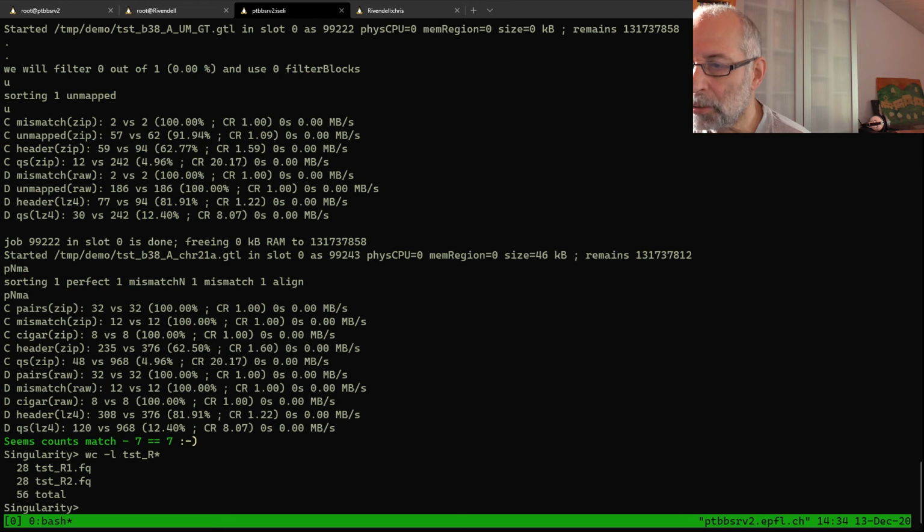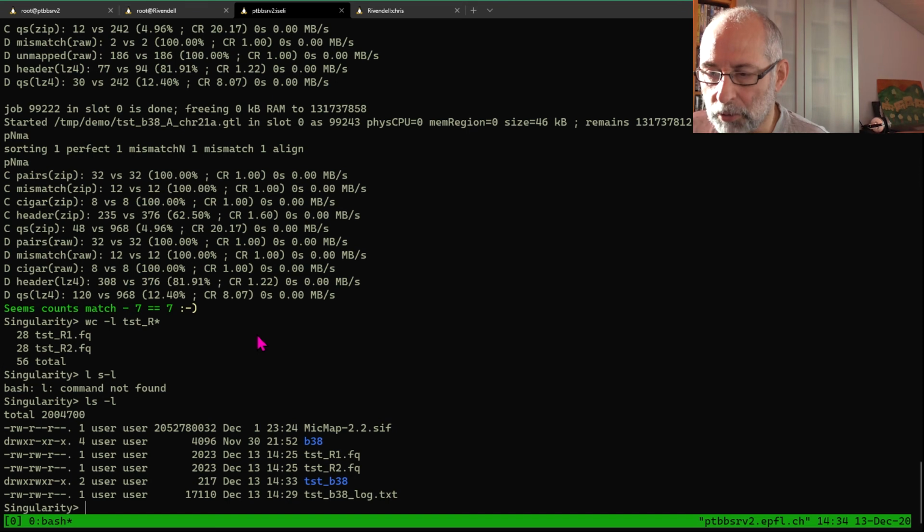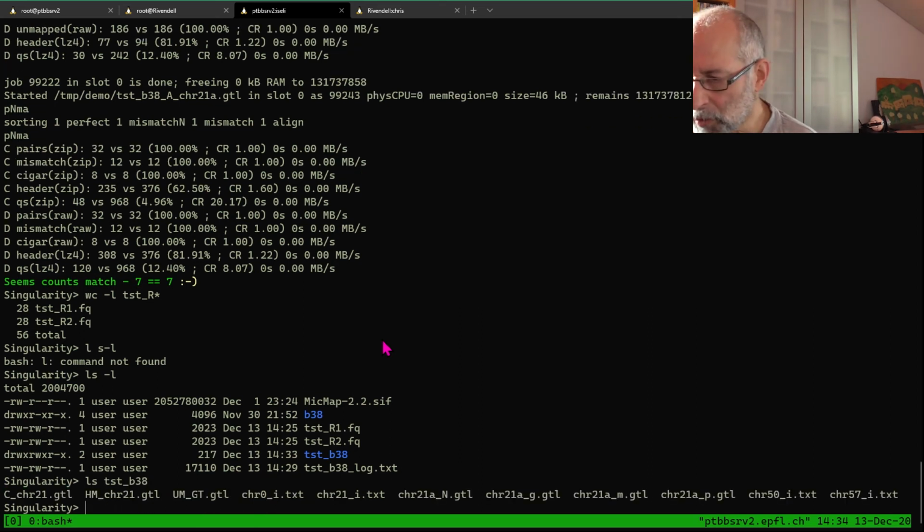Now that things are sorted, you can see that we now have this output directory where I told the command to put the results. The originating files are gone, as I specified to delete them, and in the directory itself we have then files per chromosomes and per type of reads.